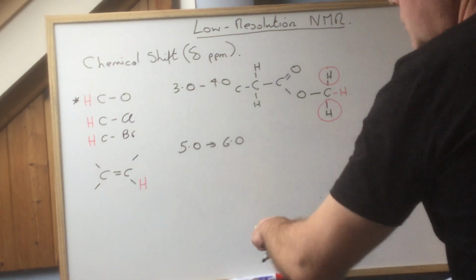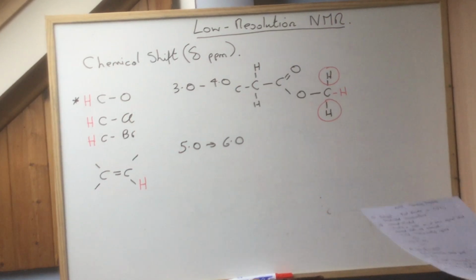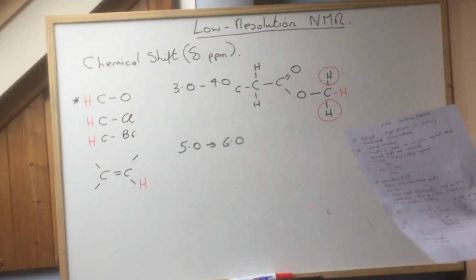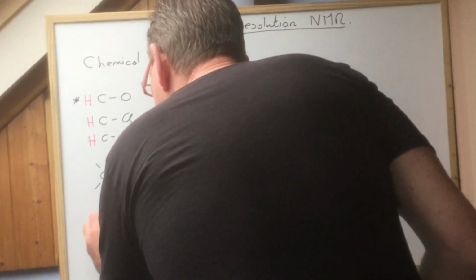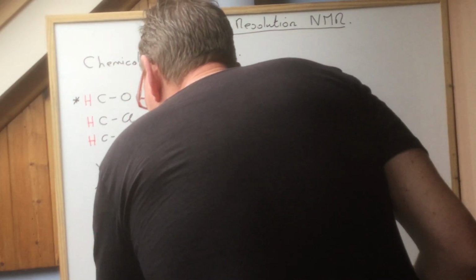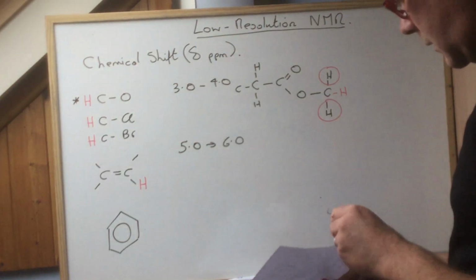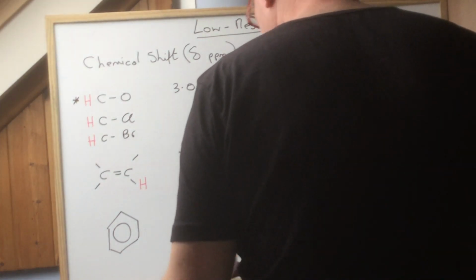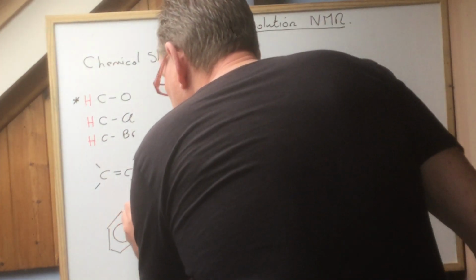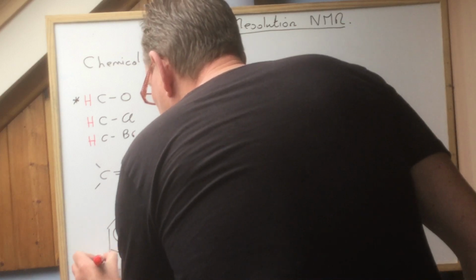Then we come to another key one, really. I hope you can all see that. I hope it's all clear enough. There's no point me drawing that out, it's fairly obvious. Which is this. You've got to watch this. Okay, this is a good one. Often questions contain aromatic rings. Now aromatic rings contain, as you well know, hidden protons, hidden hydrogens.